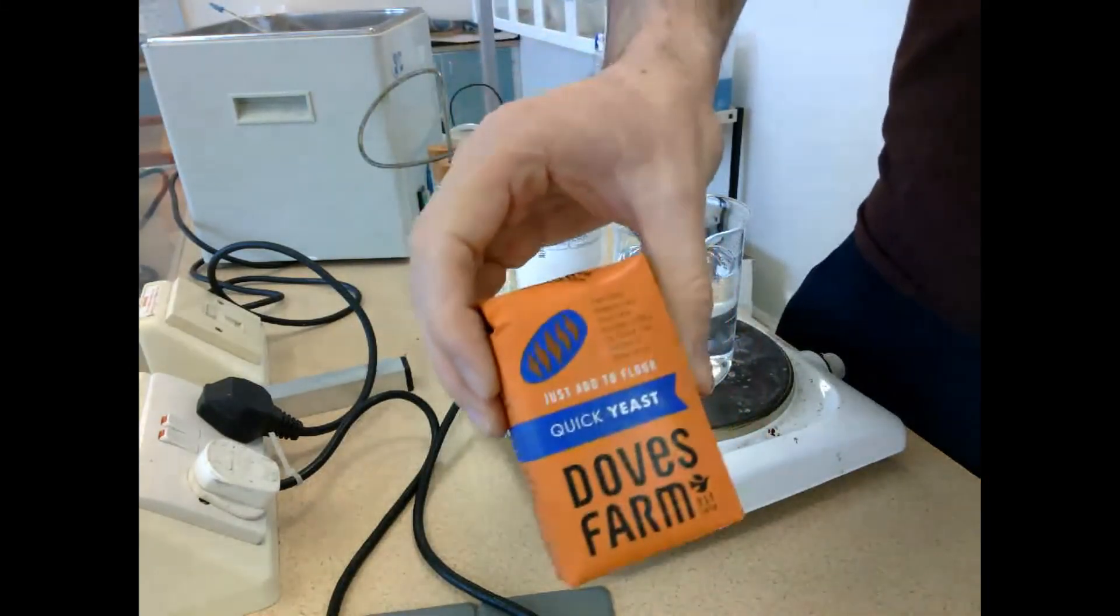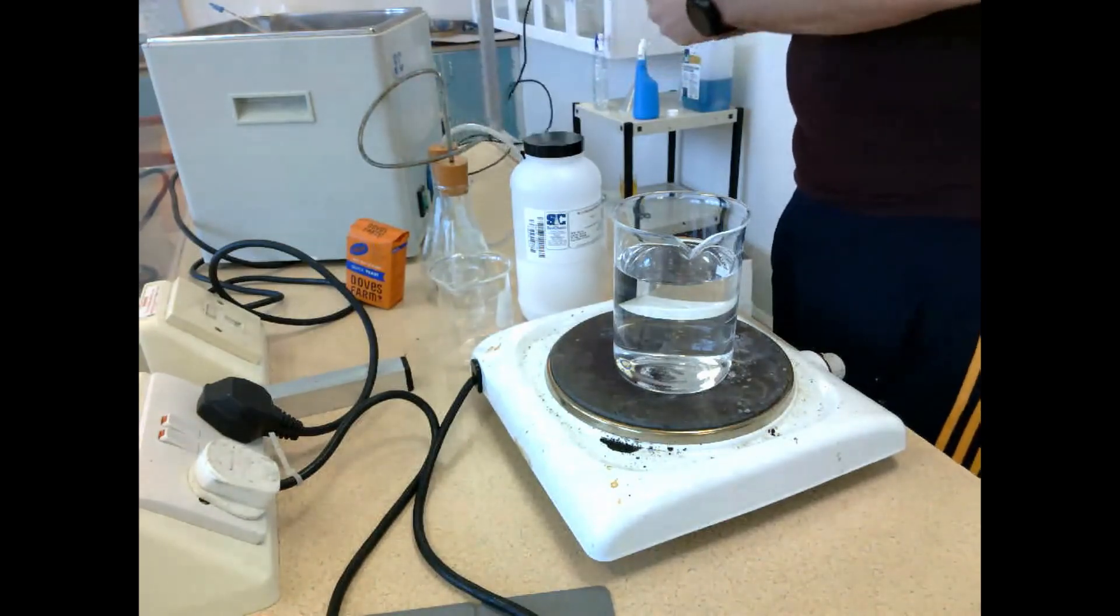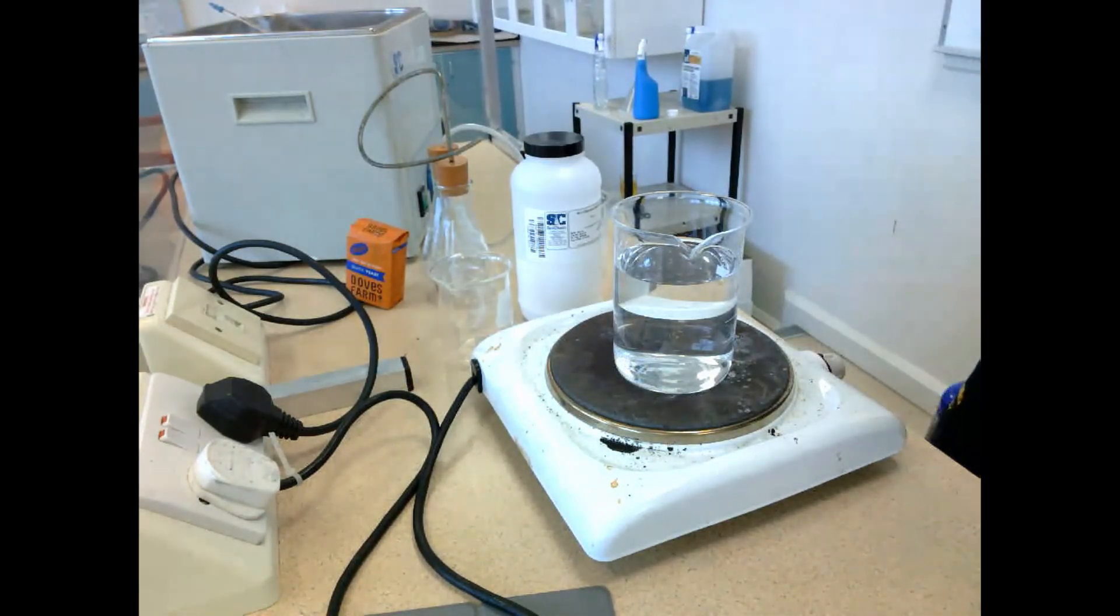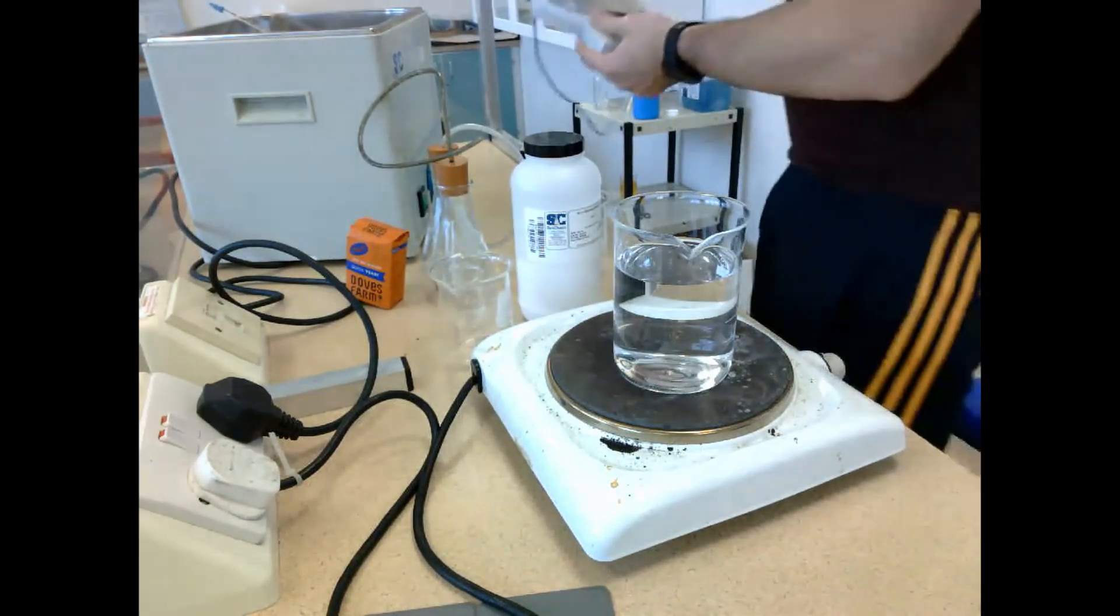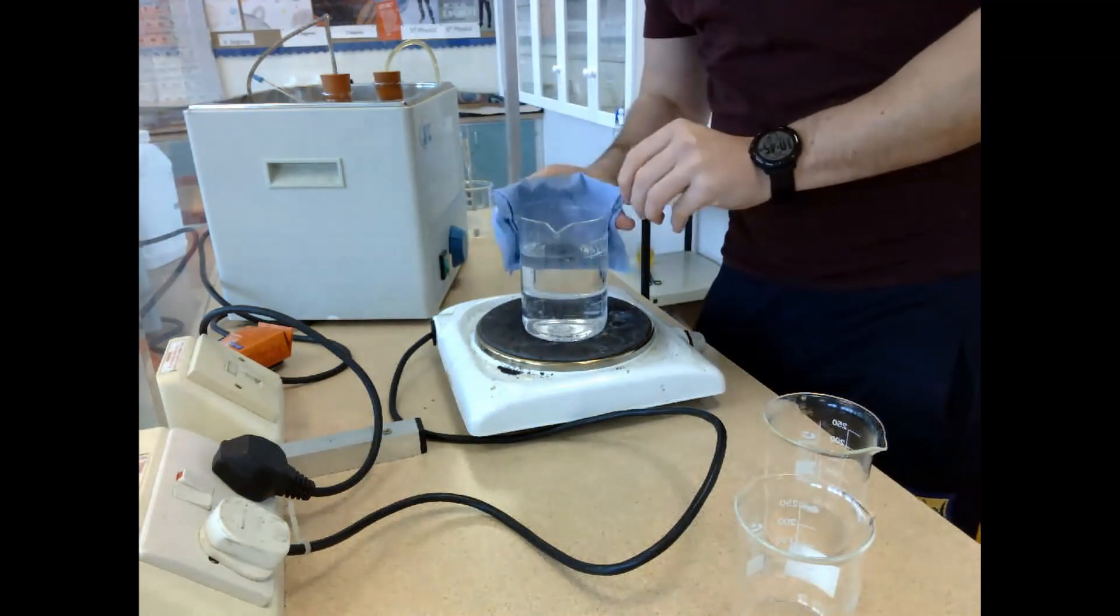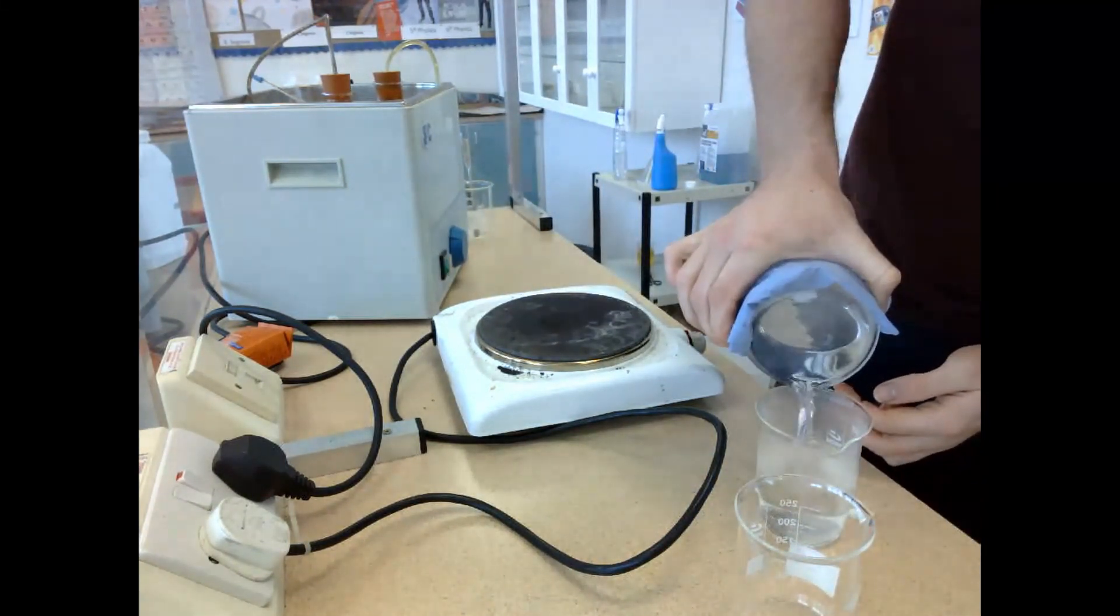In this experiment, we're going to use yeast to produce alcohol by putting it in an anaerobic situation, i.e., there is no oxygen. Then it will break down the glucose that is present to form ethanol and CO2.